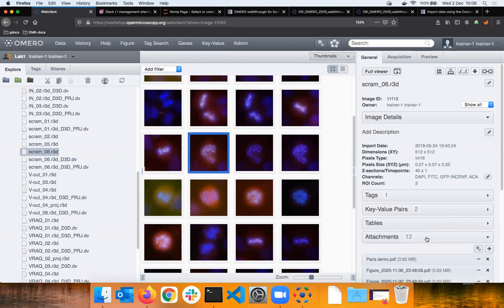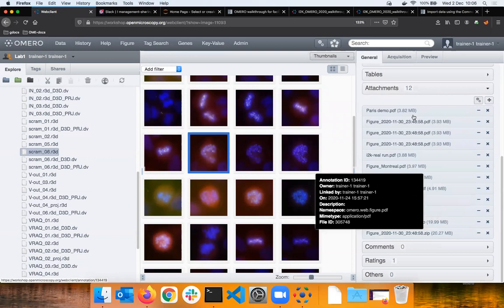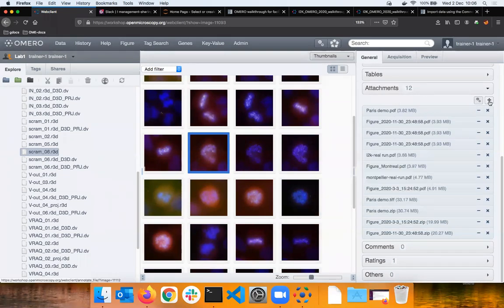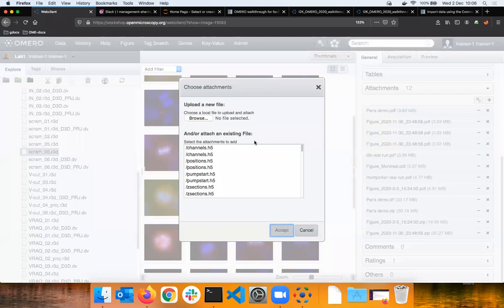And these are the attachments. Okay, this is yet another type of annotation, but this one is of huge importance, obviously. In Omero, you can go to the attachments tab, and by clicking on the plus, you can upload an attachment. This would be most typically something like a CSV with your results coming from, let's say, Fiji or other third-party imaging software, or yet another description of something captured in PDF or whatever you choose.